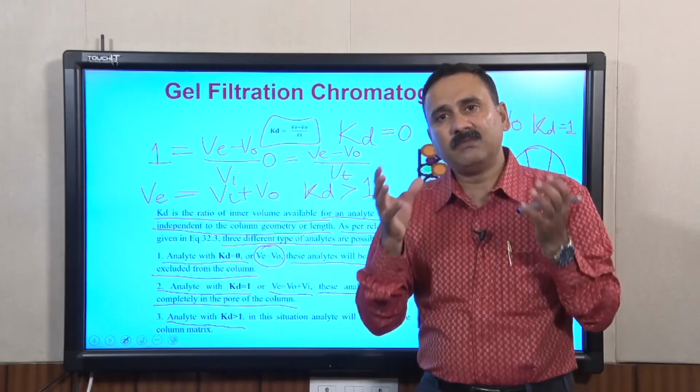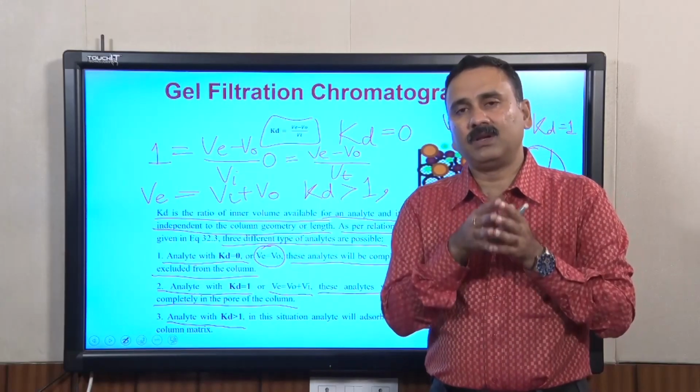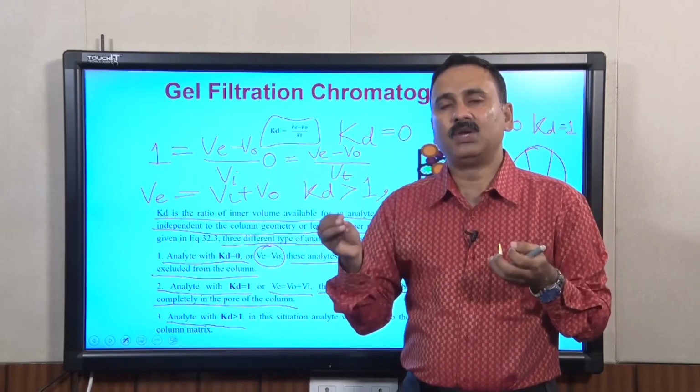That is why most of the beads people use in gel filtration do not have any kind of affinity or preference or association with the molecules.